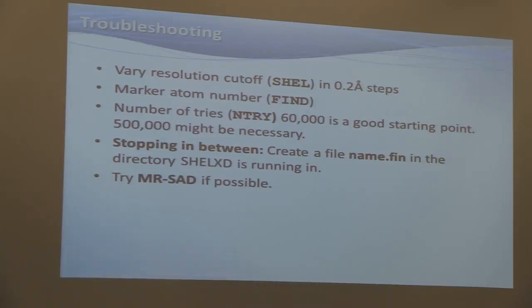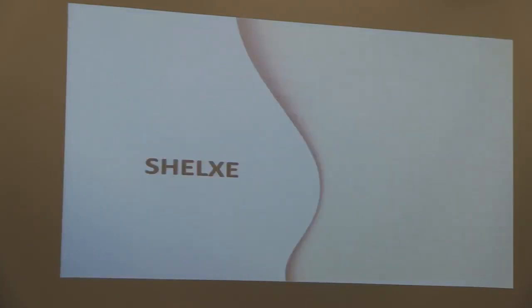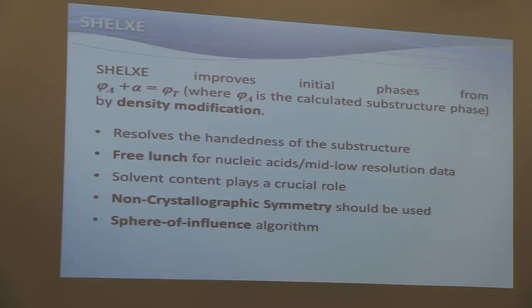And you can use MRSAD, which I'm going to talk about after talking about SHELXE. SHELXE improves the phases from the initial phases calculated from the substructure and the alpha angle.